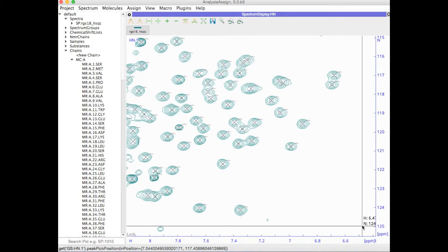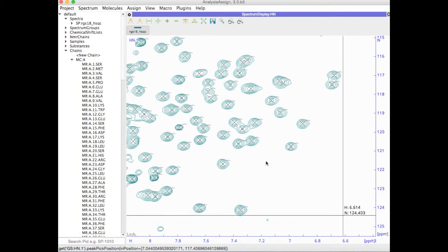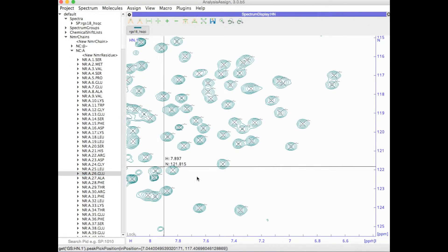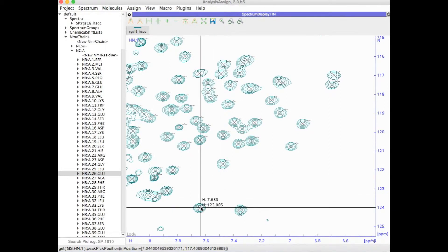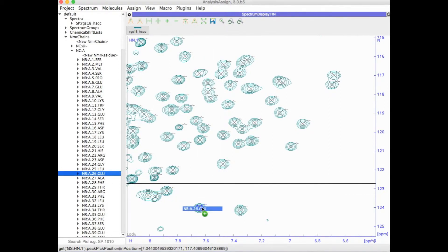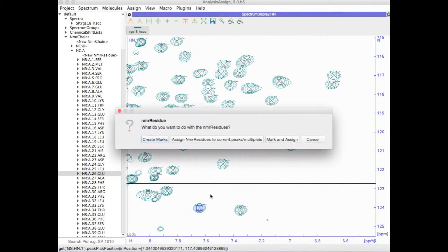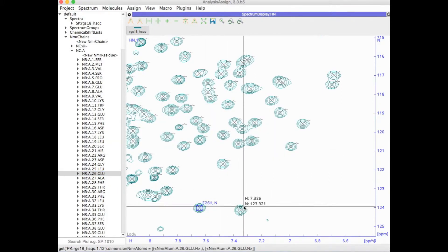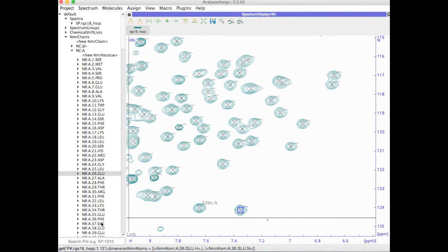Do you already have an assigned HSQC for your project? Simply load the spectrum and your sequence, generate an NMR chain, and then all you need to do is just drag and drop your residues onto your spectrum.